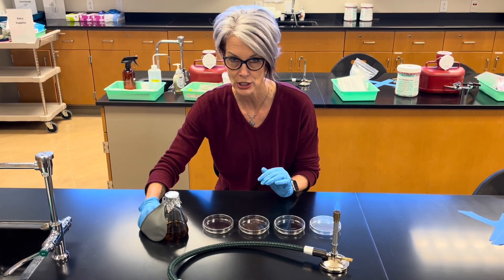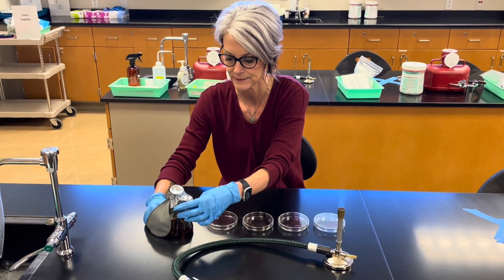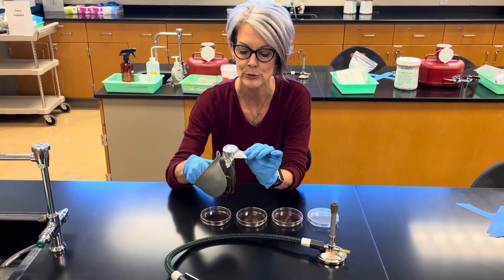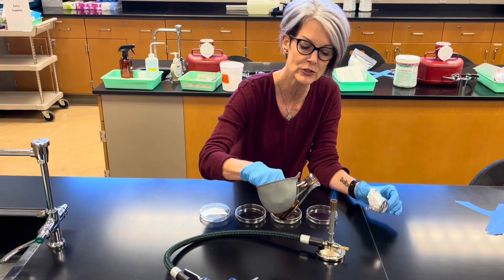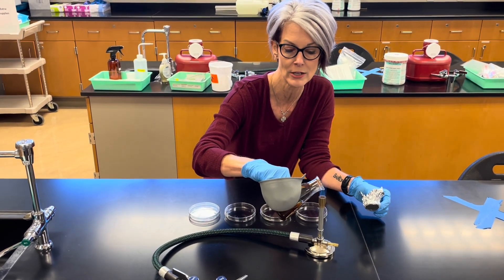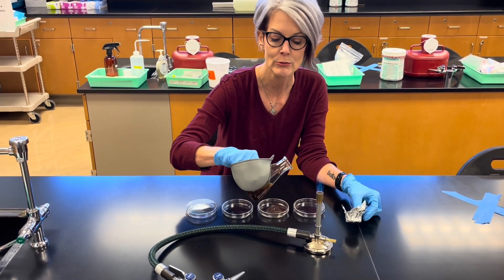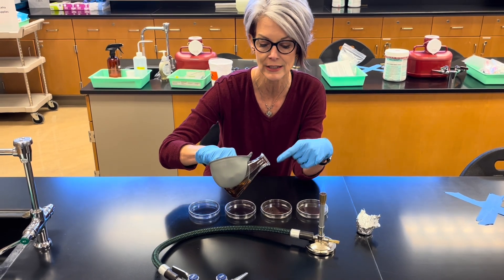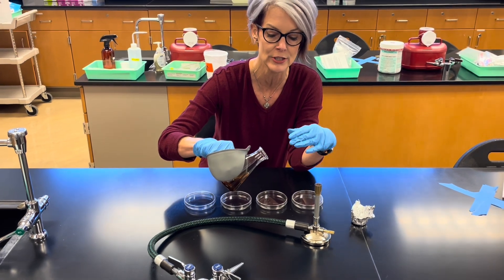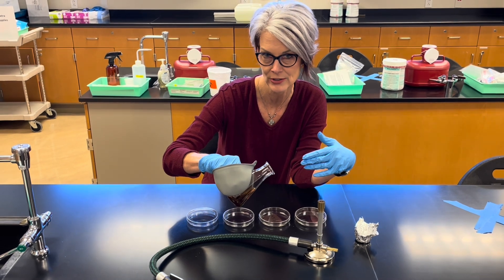Grab the flask low on the flask, and the first thing you want to do is loosen up the foil. Pick up your flask, remove the foil, and we're going to do what's called flaming the lip — just pass the lip of the flask across the tip of that inner blue cone about three times. We do this to kill any microorganisms that may be on the lip and to create air currents that push air out and prevent any microbes from entering the flask.